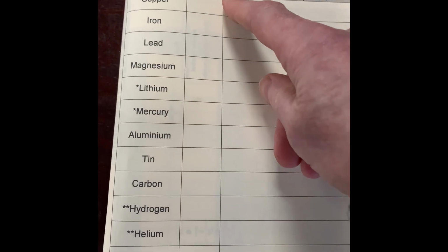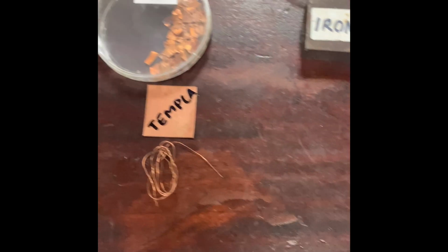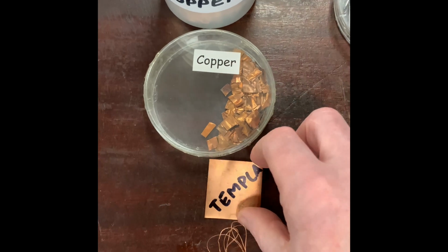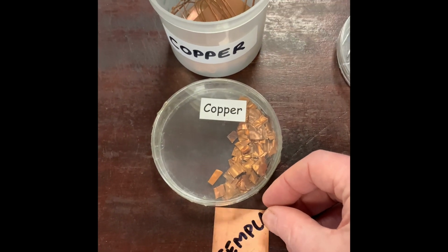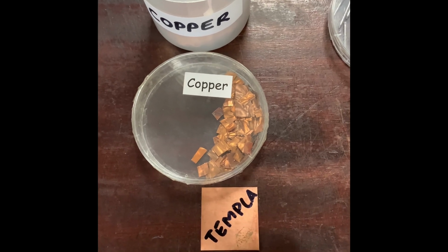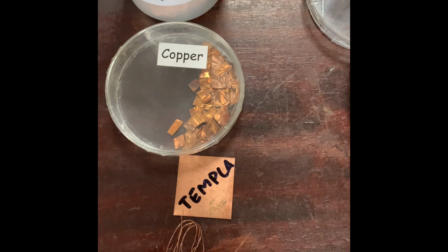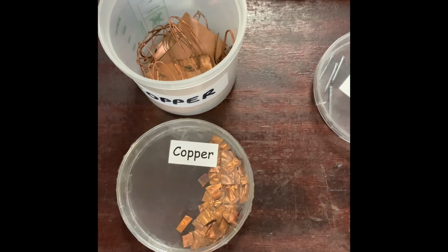Day 2, observing the properties of elements. We've got a list of elements, fill in the symbols from your periodic table, and then we're going to have a look at the properties of each metal. Starting with copper, it is a metal. Like all metals, they are shiny, which you can see here. Copper is a ductile metal, which means it can be drawn out into wires, like copper wire here, and they're in different formats.